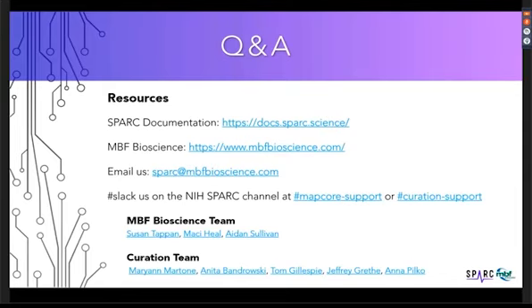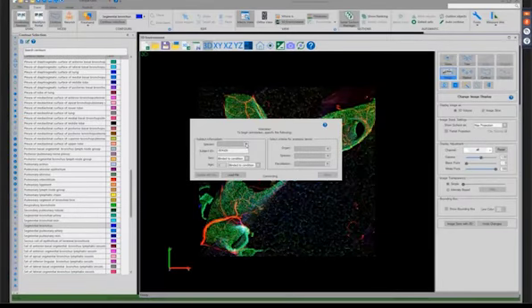All right, so Maurice, I hopefully am saying that right, asks what species are already available for segmentation and is it possible to request new species to be added? Do you want to flip to the species that we have already that we query? This is Sue Tappan. So we've built this list of species based on the known information that we have from current SPARC researchers. So if you are a SPARC researcher and you need an additional species added, reach out to us and we'll work with the curation team to get that added. We definitely want you to be able to manipulate and record the data and access the term lists that are necessary.